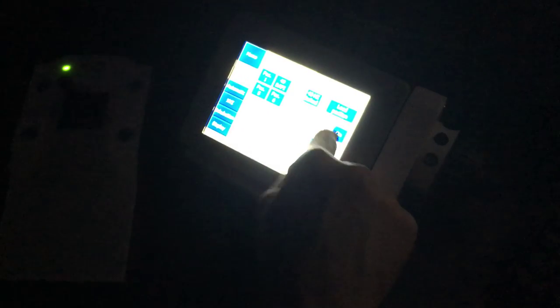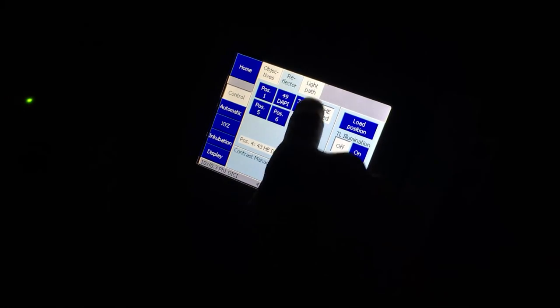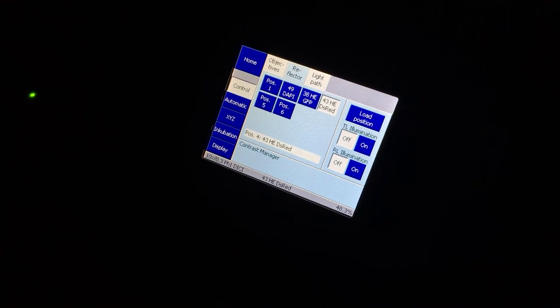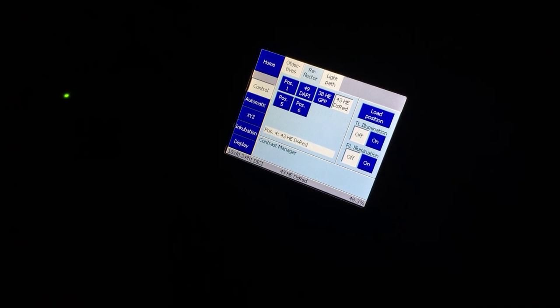The whole point of showing you that is: before you even start imaging, you've got to find where you need to be in your sample. Use the touch screen to find where you need to be, then go from there. You can always check the different samples to see if everything is lighting up where it should be. You've got three colors on that one.